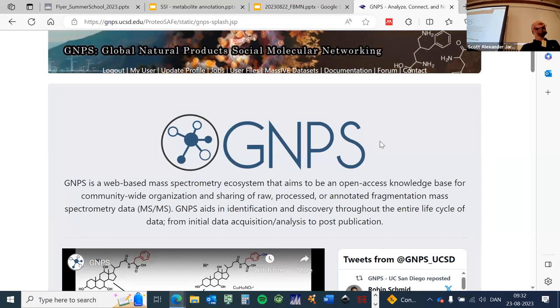Have they uploaded any data into their profiles or not yet? Do you know if they have uploaded data to their GNPS usernames and things like this, or not yet? Okay.